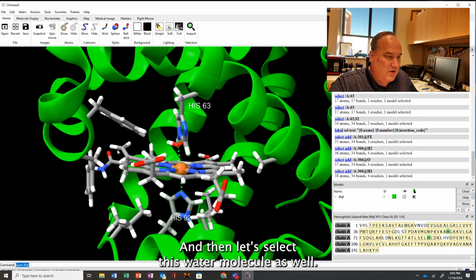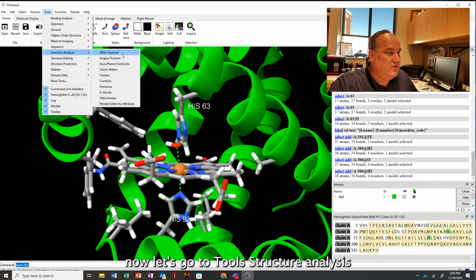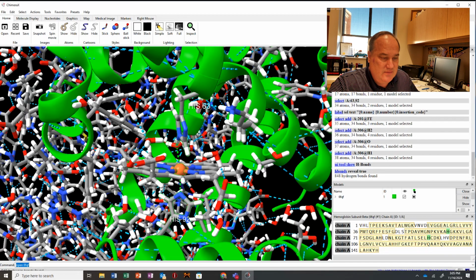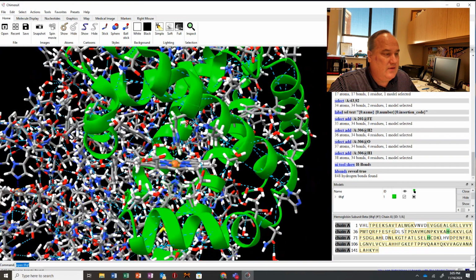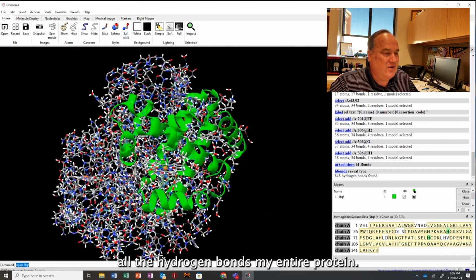And then let's select this water molecule as well. Now let's go to Tools, Structure Analysis, H bonds, and so now let's go ahead and select. And that selected all the hydrogen bonds in my entire protein.